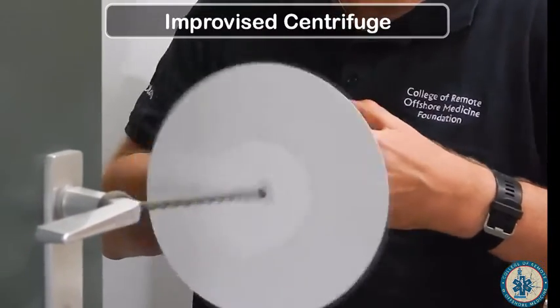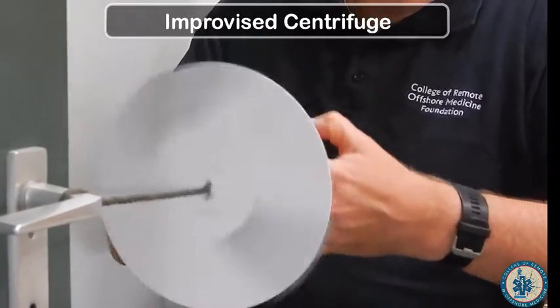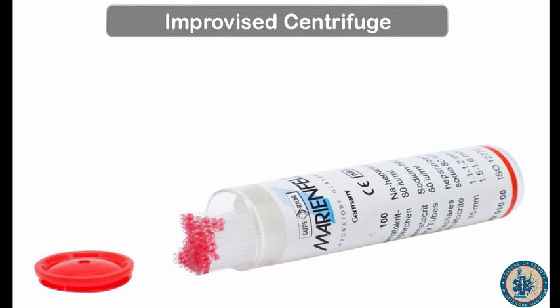Today at the college we will talk about how to create your own improvised centrifuge. You will need to get a hold of some capillary tubes with heparin. The heparin is very important because it will keep your blood from coagulating.